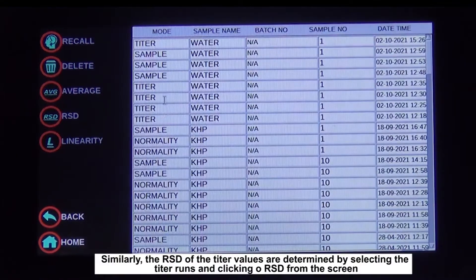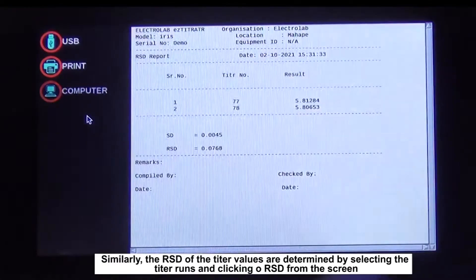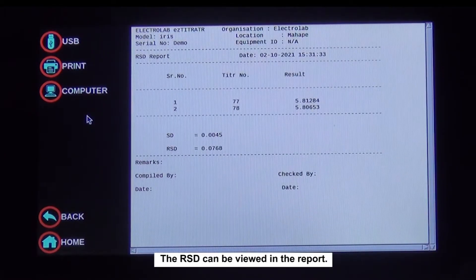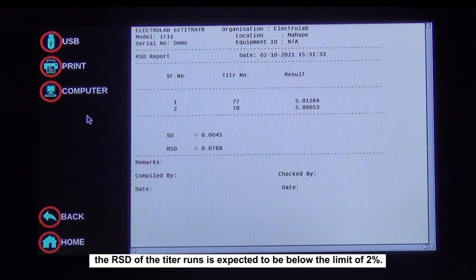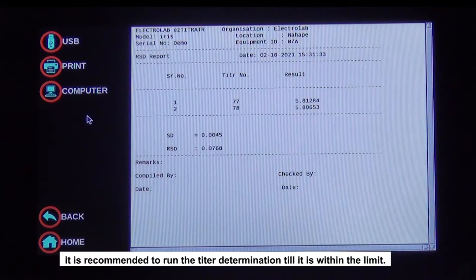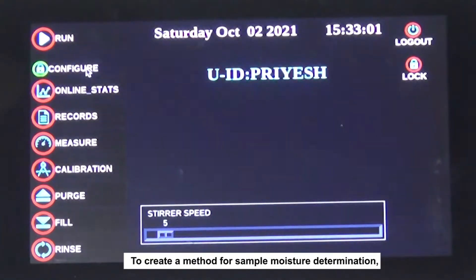Similarly, the RSD of the titer values is determined by selecting the titer runs and clicking on RSD from the screen. The RSD can be viewed in the report. Ideally, the RSD of the titer runs is expected to be below 2%. If the RSD is found to be higher than 2%, it is recommended to run the titer determination again until it is within the limit.